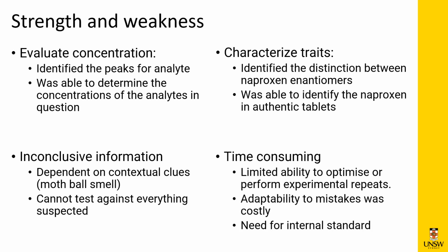The main weakness felt during this investigation lies in the time-consuming nature of the process, where for the analysis of a single data point, 6 to 7 minutes must be allocated for each sample. With the use of an autosampler, this issue was minimized. However, due to the short windows of instrument operation, the flexibility to make changes to either optimize the data or perform quality assurance was minimal, especially due to our understaffed team.